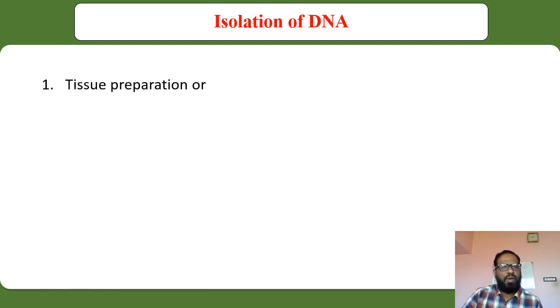In this video, we are only going to concentrate on the isolation of genomic DNA, because its extraction is very important. For the isolation of genomic DNA, we need tissues. We have many different types of tissues in our body, and you may choose one or two types of cells from a particular organism. We have to choose which tissue we want to extract the DNA from.